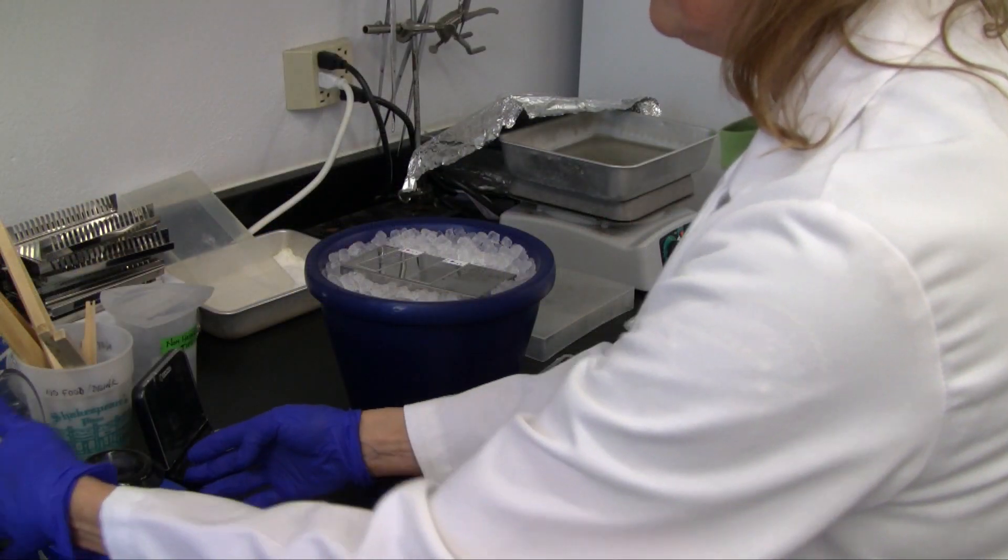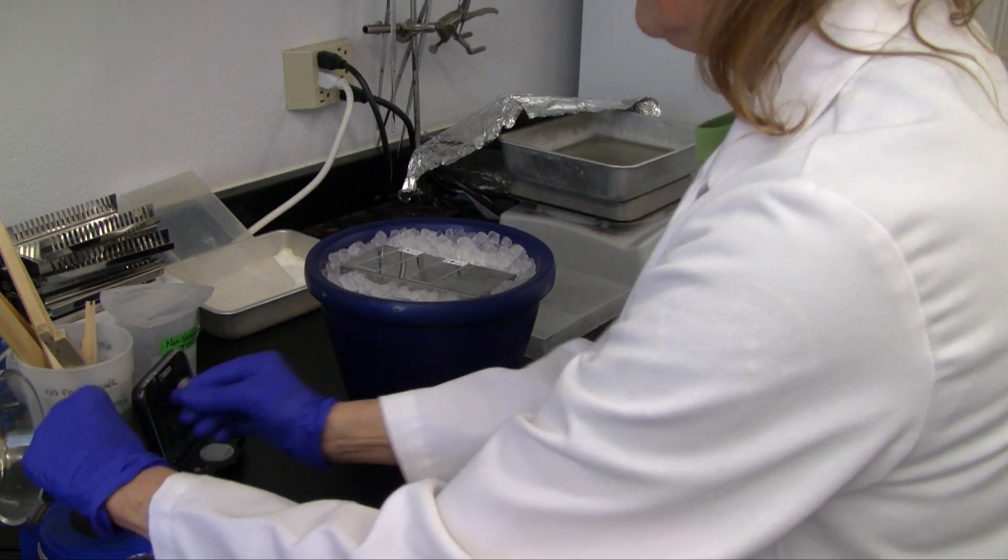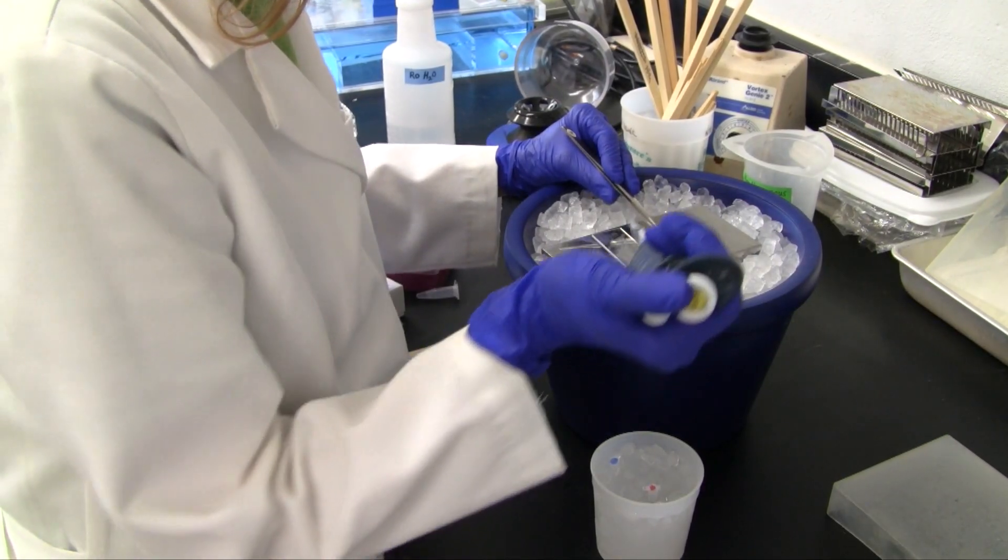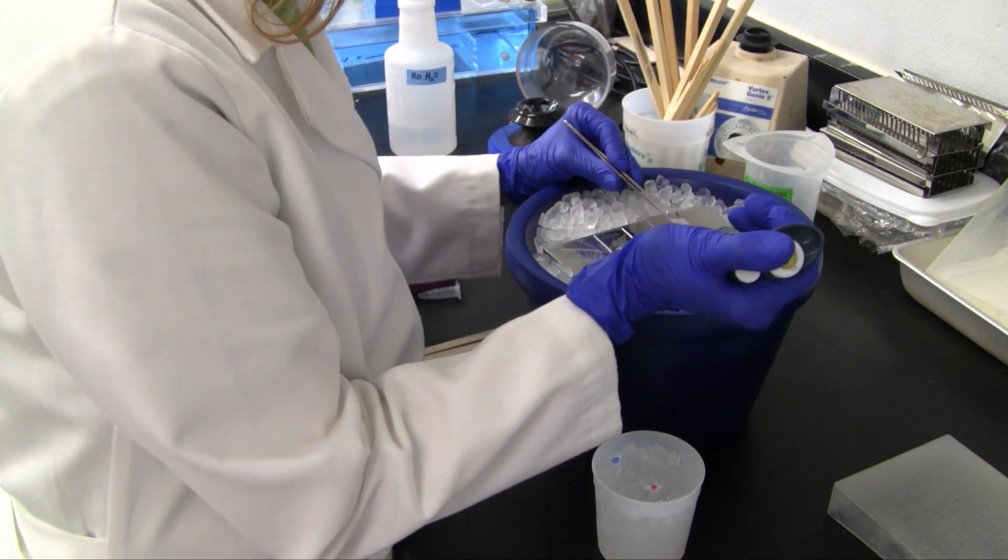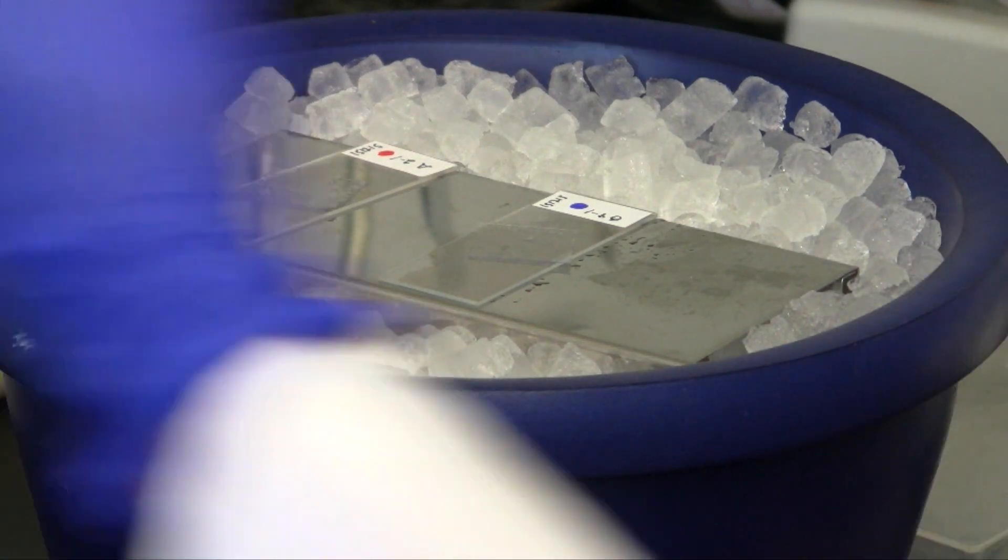The probe tubes are briefly centrifuged and returned to the ice bath. Aspirate the amount of probe needed for one slide, lift the cover slip, dispense the probe, then replace the cover slip.